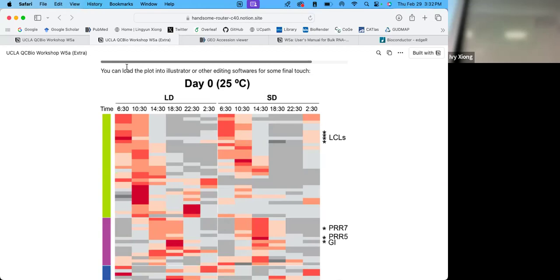Well, you can just run this whole script. You can highlight everything. Yeah, but you will have to specify the arguments. These are the arguments. So if you're trying to do it within R Studio, you just change this to the gene names.